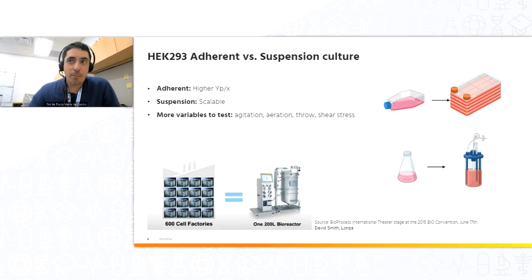And then if you go for bioreactors, suspension bioreactors, like this one here, we're going to work with volume. So in other words, we'll have to use more clean room space, which is very expensive, if you go for adherent systems. The process will require more labor, more scientists, or more operators working on the process. We have less control, we have less automation. You have all these problems to deal with if you go for adherent systems.